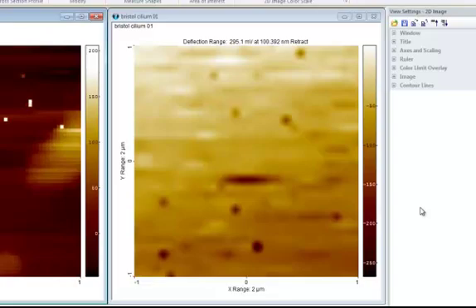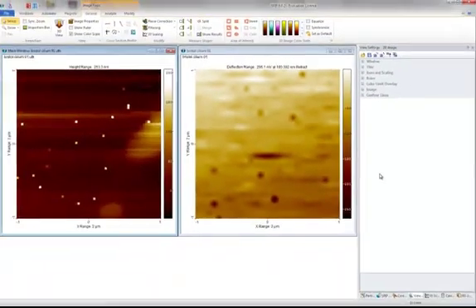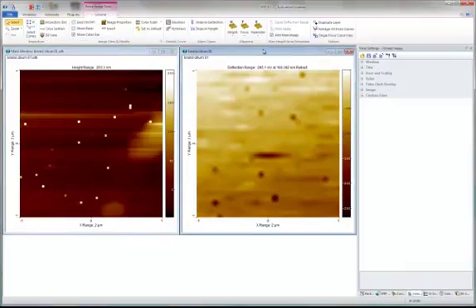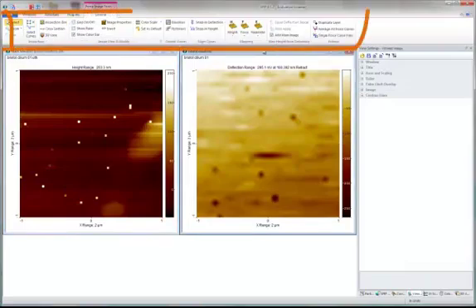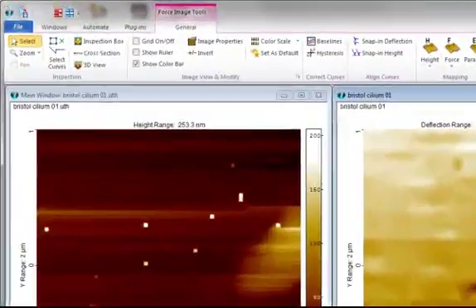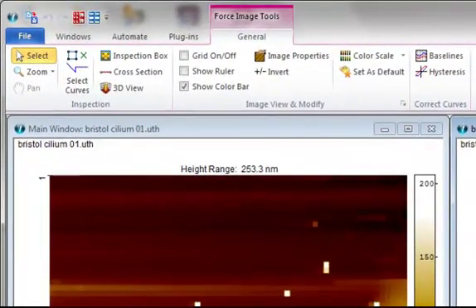To get started, simply select the force volume image to have all the dedicated force volume tools appear in the ribbon. Now we can choose the selection tool and select a curve in the image.